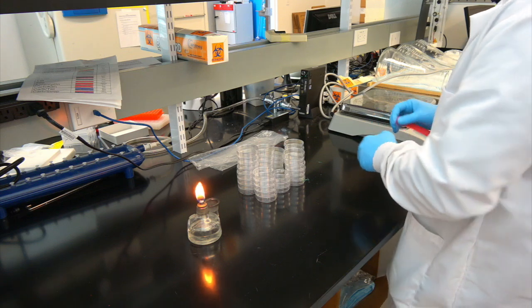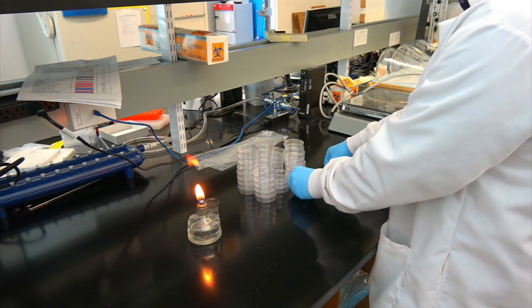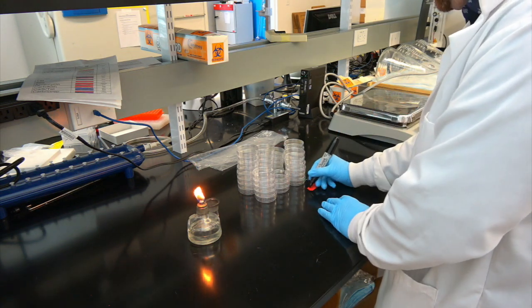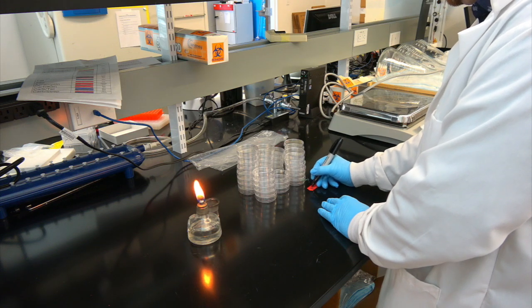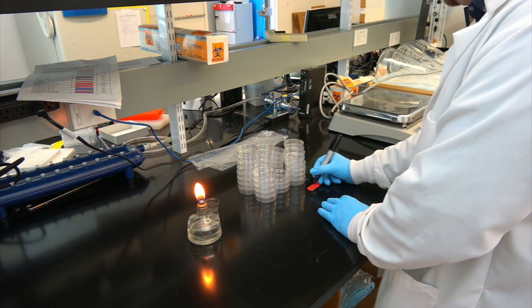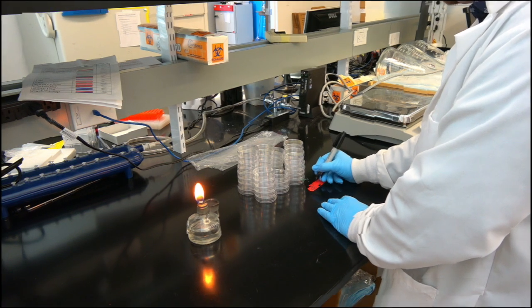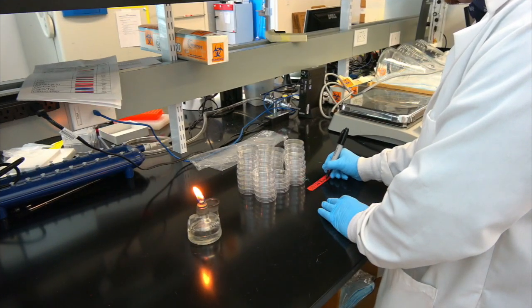Now we label our plates with the medium and the antibiotic they will contain. We recommend using a batch labeling system to speed up this process. For instance, we simply label our bags instead of our plates. If you label your plates in more detail, be sure to write on the bottom of the plates instead of the top.